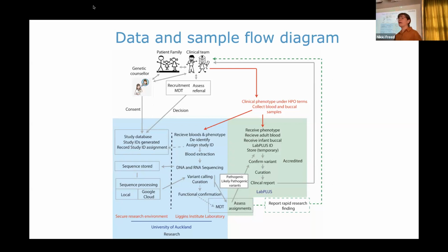On top of this as well, we also have a collaboration set up with the Victorian Clinical Genetics Service in Australia. We'll be sending them de-identified DNA, and they'll be running that through their pipeline as well. They use short read genome sequencing data. So we'll be able to compare our data to their short read sequencing as an extra validation in QA.